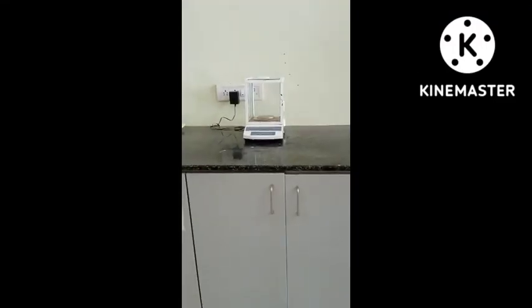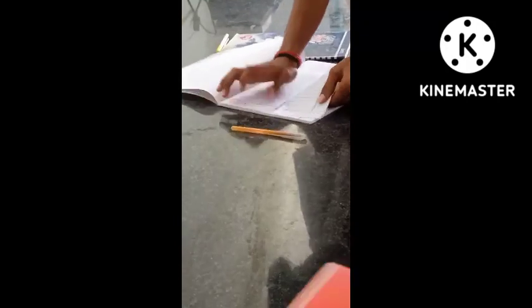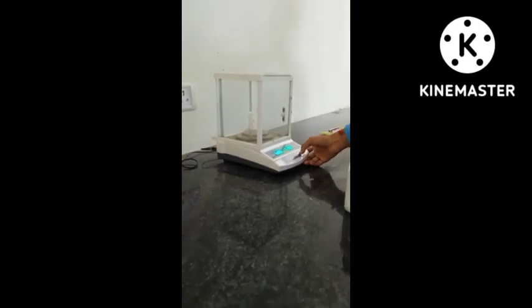So hey everyone, it's me Pooja, and today we are going to see how we can do the titration with all those things. So here we have a weighing machine, and now we are taking one paper and making one strip like thing so that we can keep or measure that.